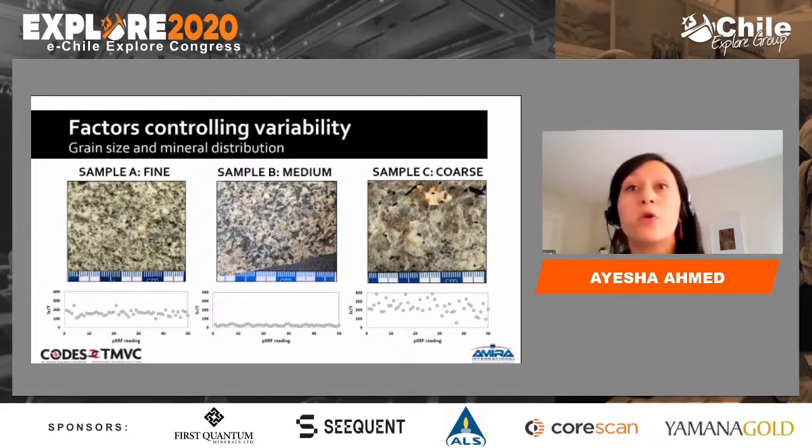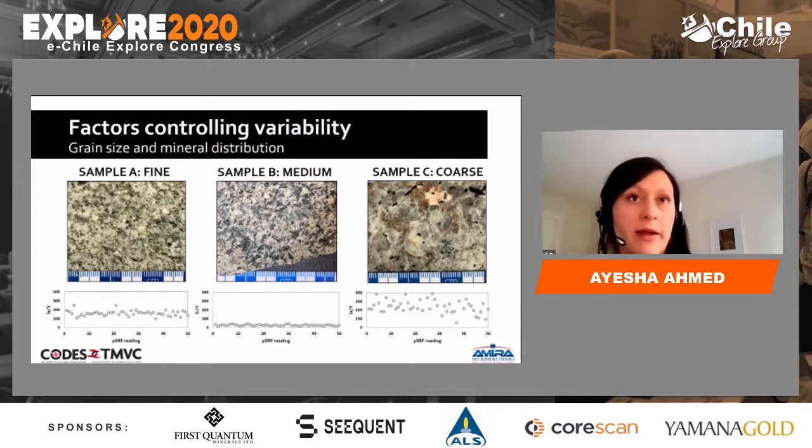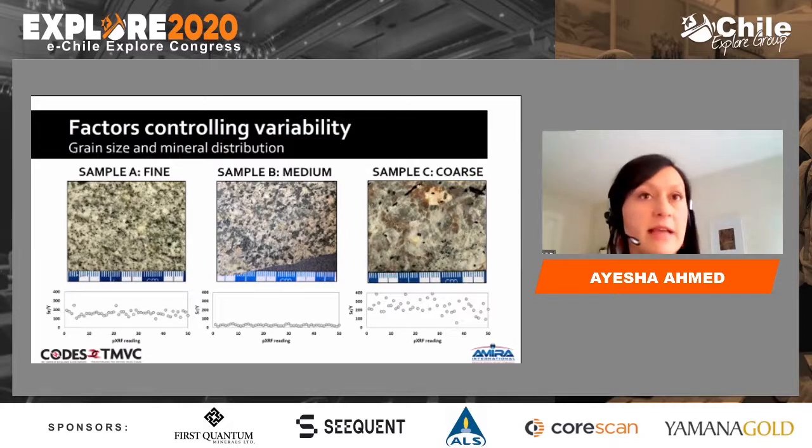And certainly the coarse grain sample on the right is showing a much wider range of values compared to other grain sizes. But still, from a practical point of view, if we were to pick 3 analyses at random from each of these samples, we would expect to represent the sample population quite well. Although it would be lovely to collect 50 analyses on every sample, this is, of course, neither time nor cost effective.